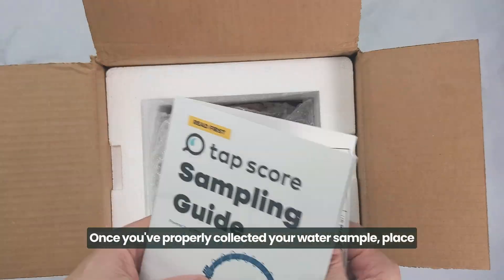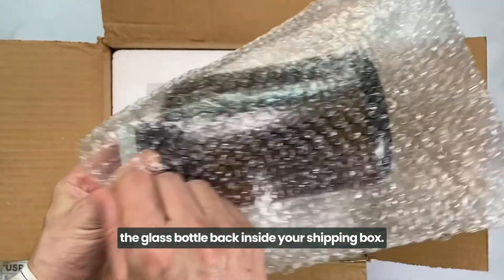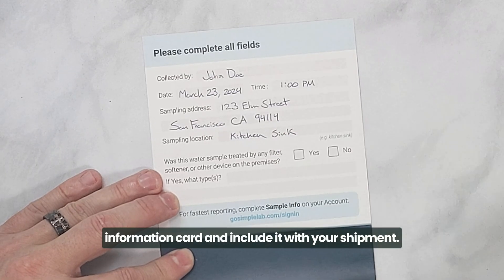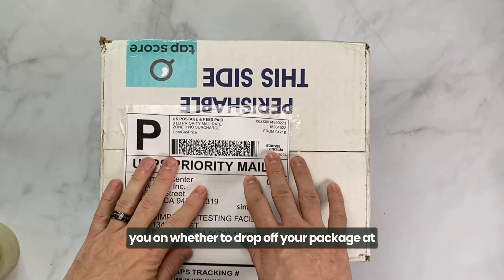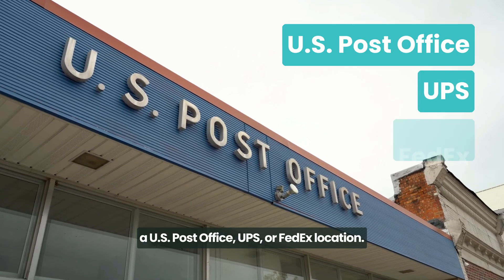Once you've properly collected your water sample, place the glass bottle back inside your shipping box. Don't forget to fill out your water sample information card and include it with your shipment. Attach your prepaid return shipping label, which will guide you on whether to drop off your package at a US post office, UPS, or FedEx location.